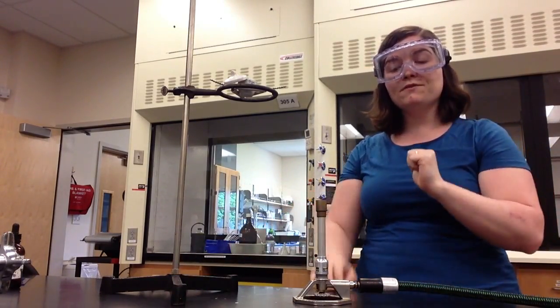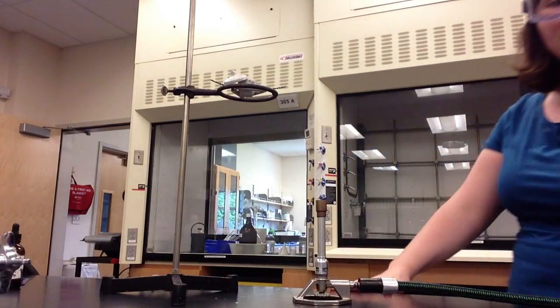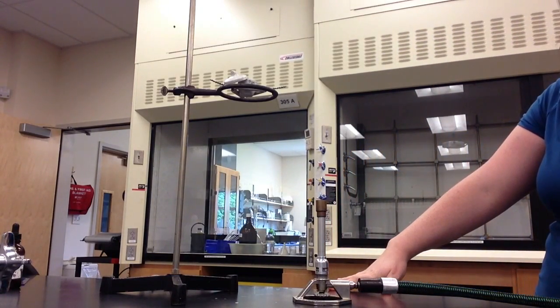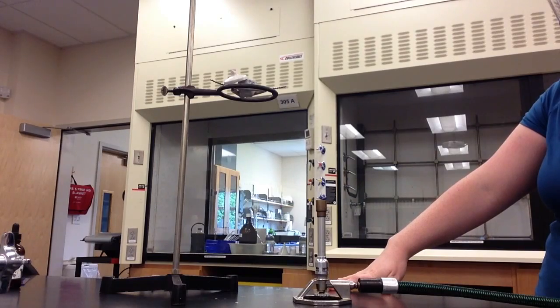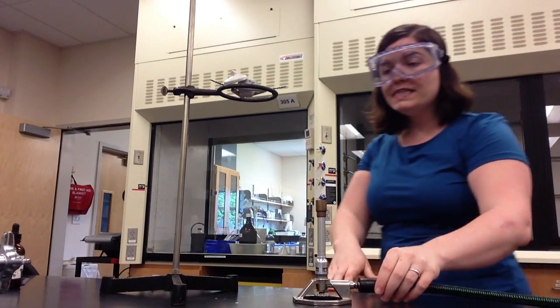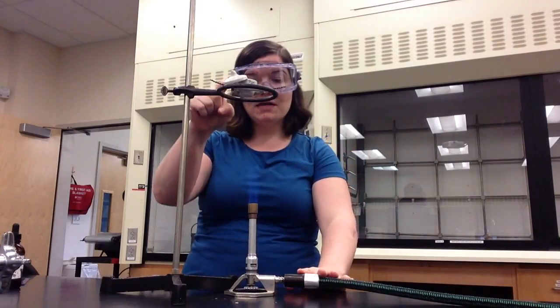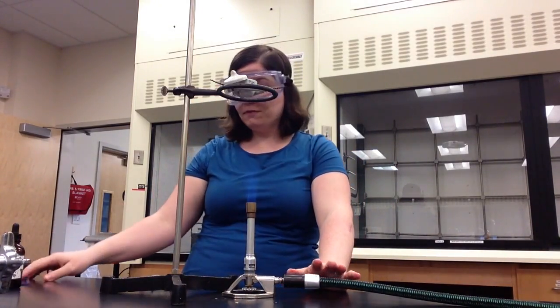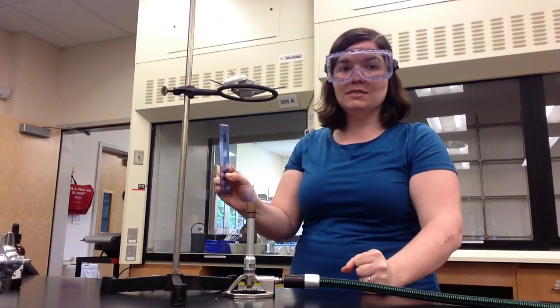I can tell right now the Bunsen burner flame is going to be a little too high, so I'm going to lower it down by closing the handle of the gas. I now have 6 to 8 centimeters distance between the bottom of the crucible and the Bunsen burner flame. If I'd like, I can measure that distance using a ruler.